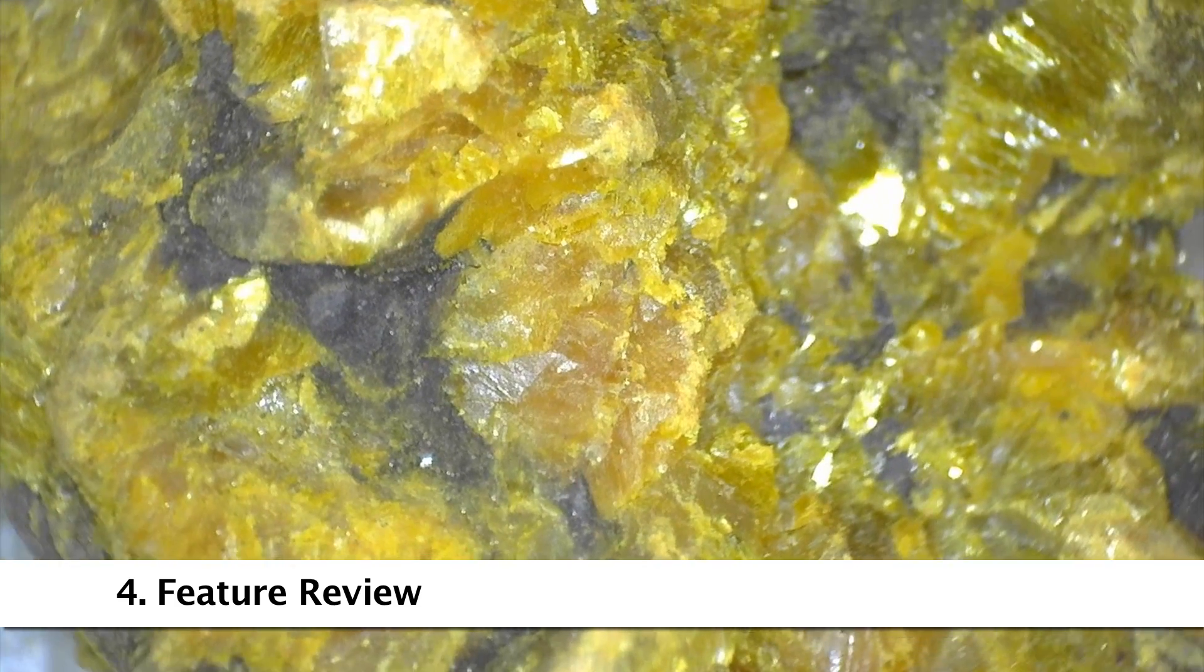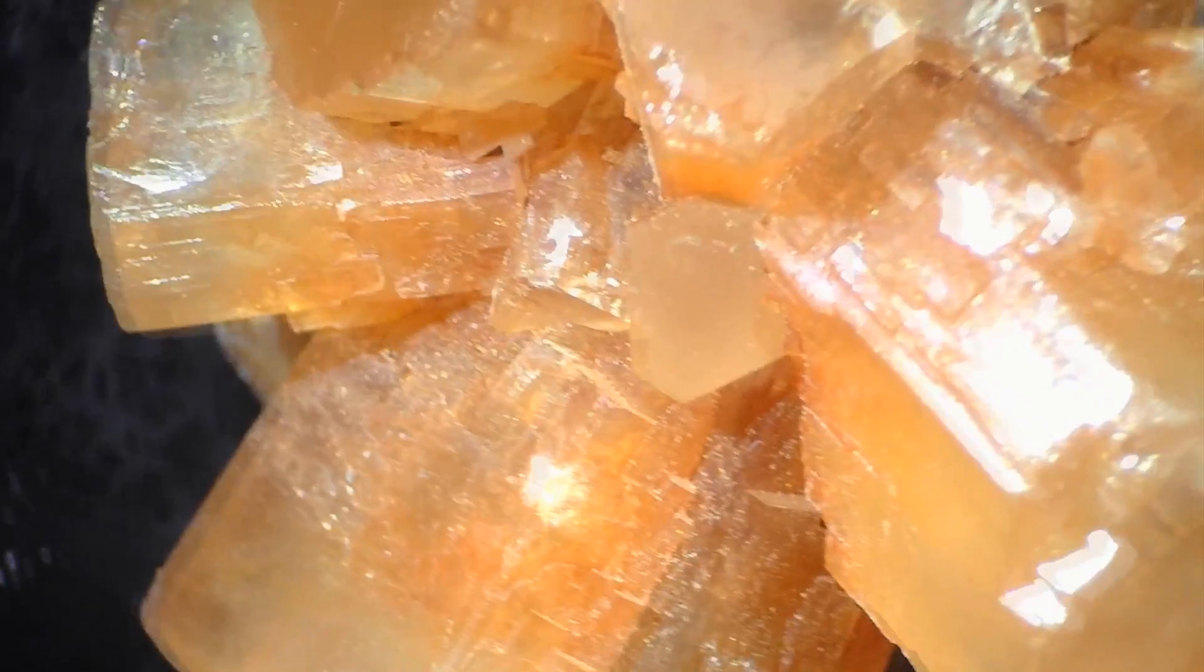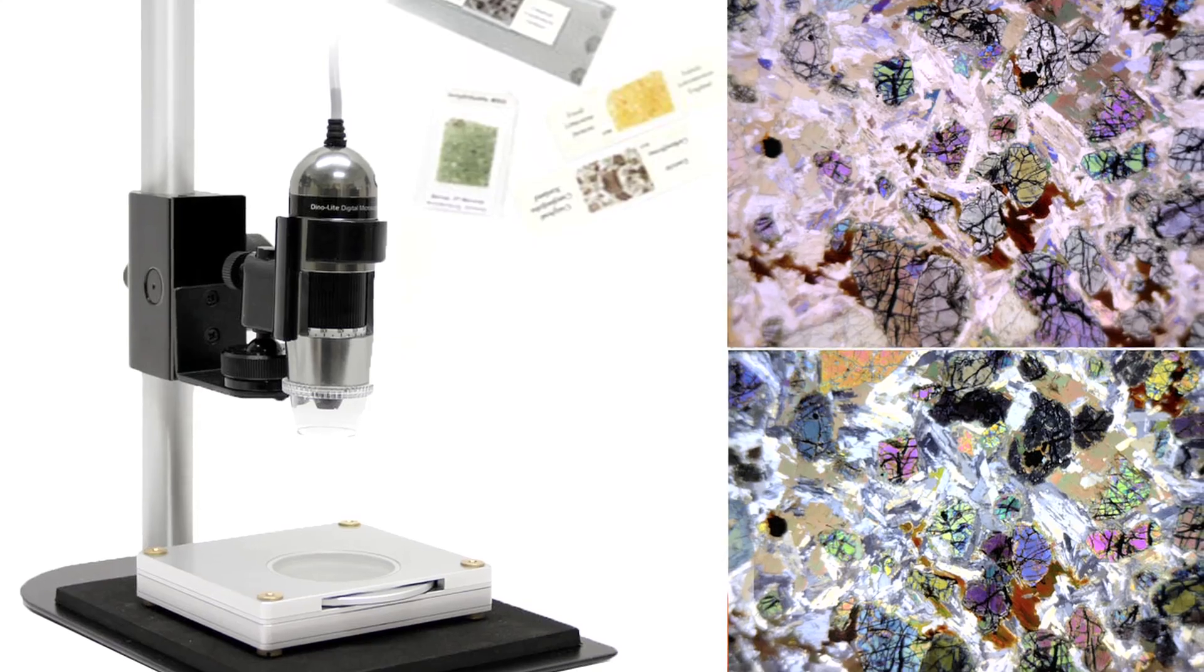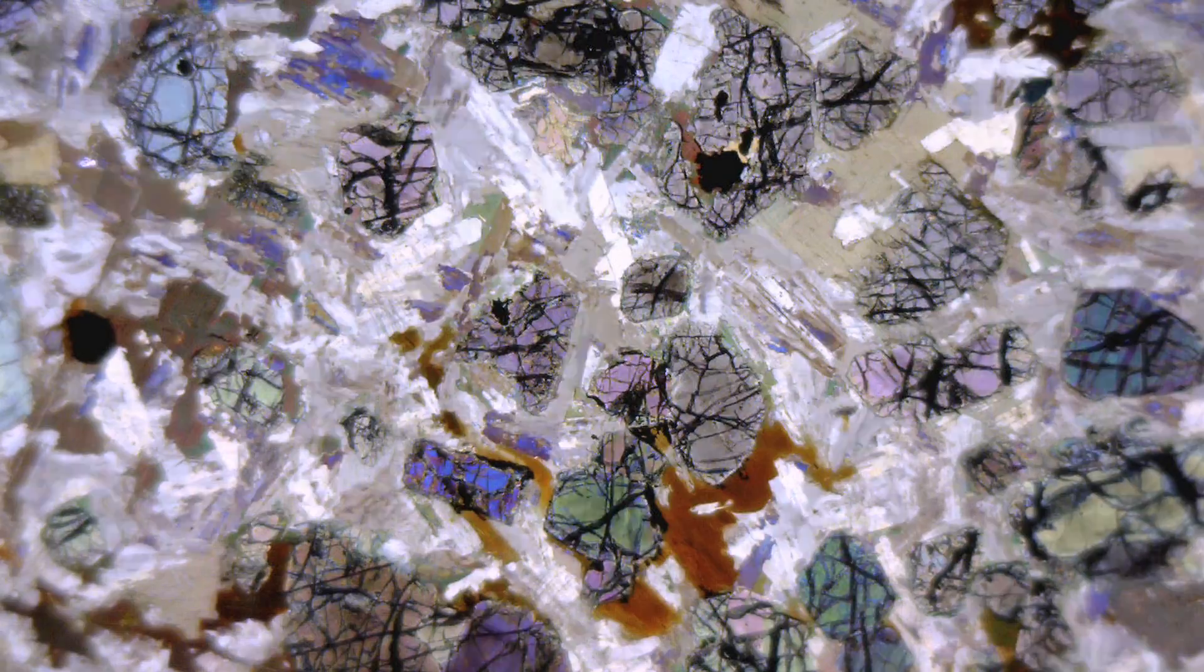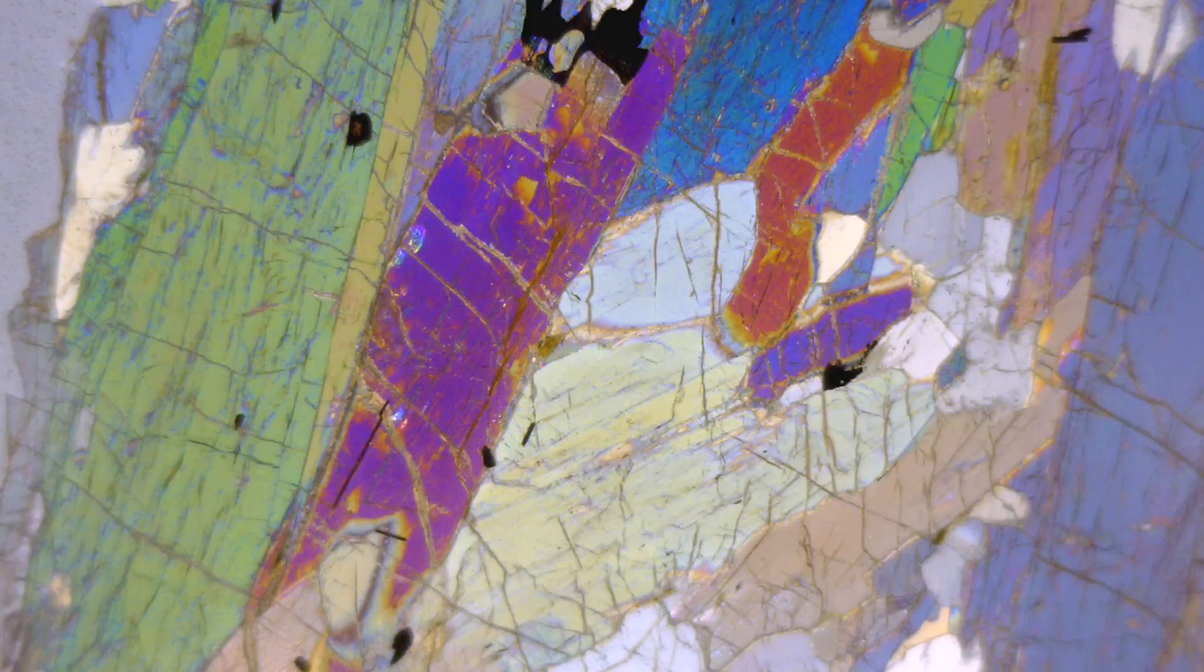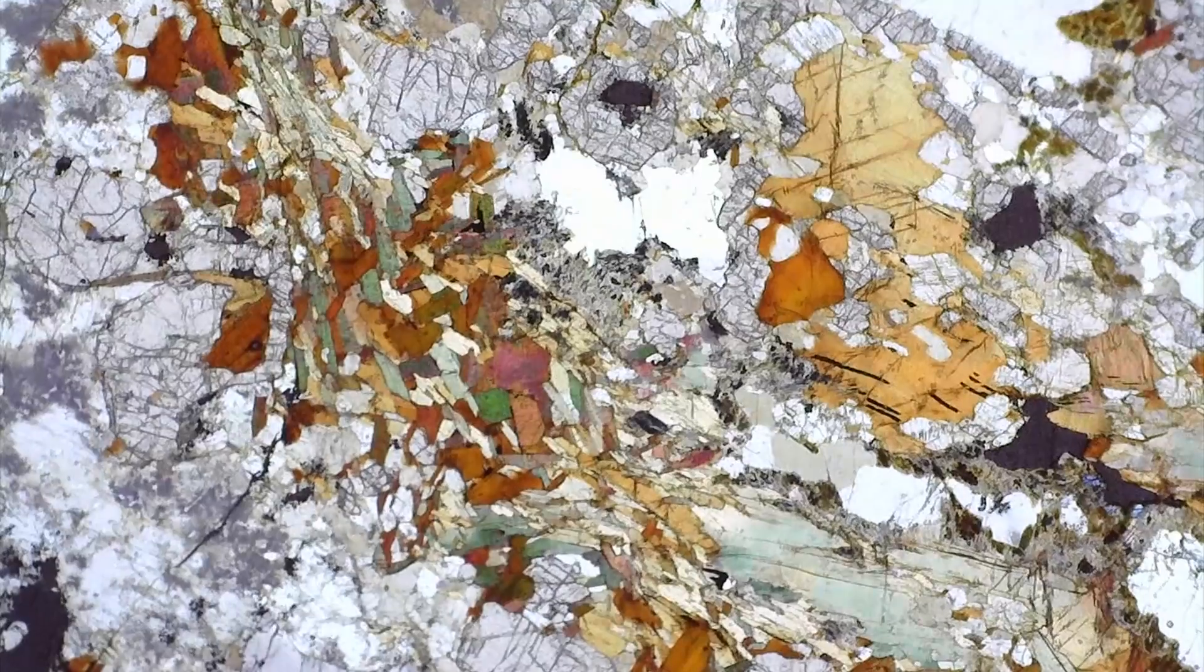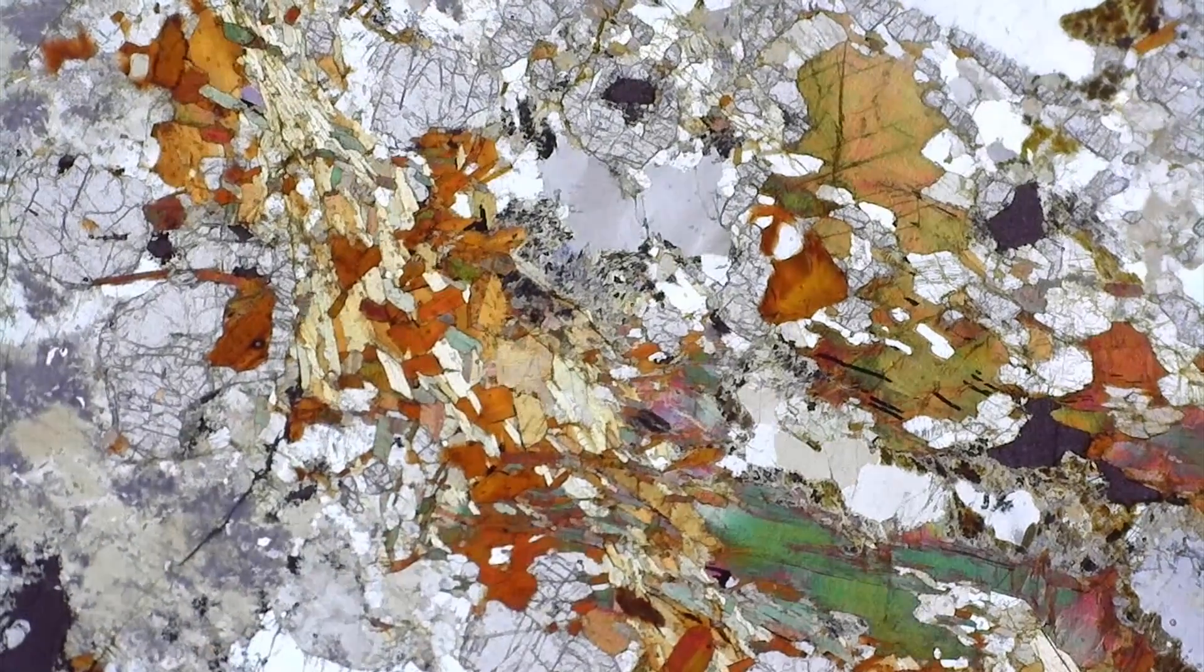DynoLite digital microscopes are easy to use, include feature-rich software, high-quality imaging, all in a compact portable design. Combined with various budget-friendly models, a large selection of accessories, and the ability to simulate cross-polarization microscopy, DynoLite microscopes are the obvious choice for users in any application.